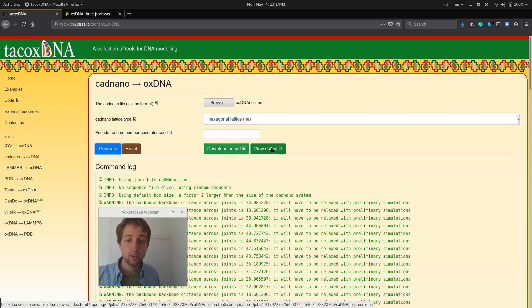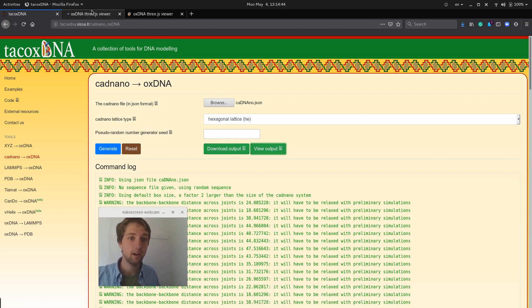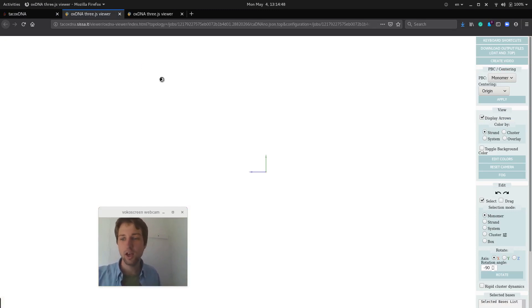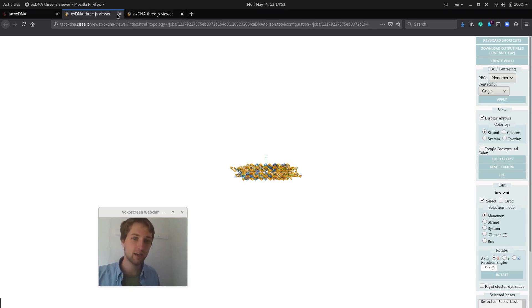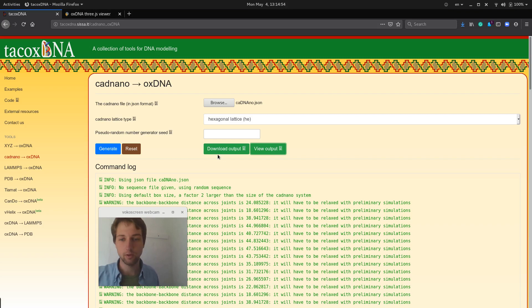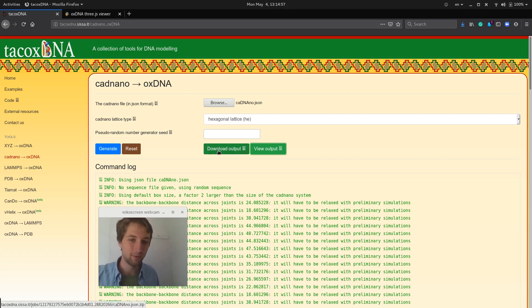One thing you could do is to view the output directly, but this will launch a slightly outdated version of OxView. So to make sure that you actually have the latest version and a downloaded version, we download it instead.